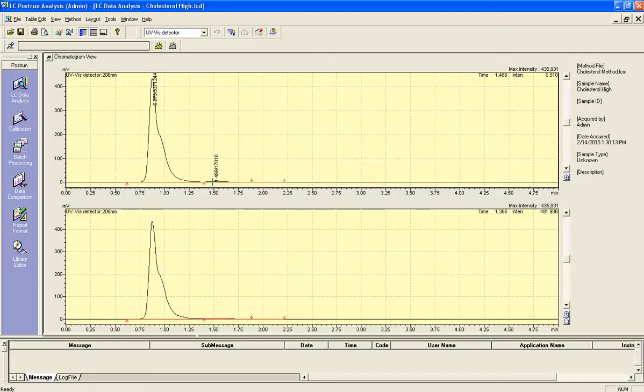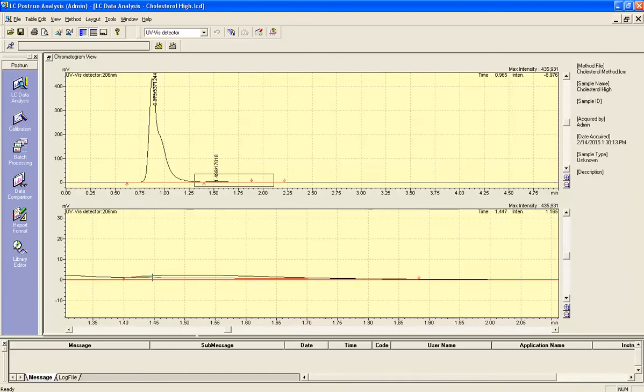It doesn't look like there's a peak here at all, right? If I just used my own judgment to look at this chromatogram, and look down here at the bottom without the numbers, it's the same thing. This one just has the times, this one does not. This looks flatlined to me. I don't see a peak, but if I click and hold and drag into this area, then I will actually see a hump that leaves the baseline and eventually returns back down to the baseline. So there is something there.